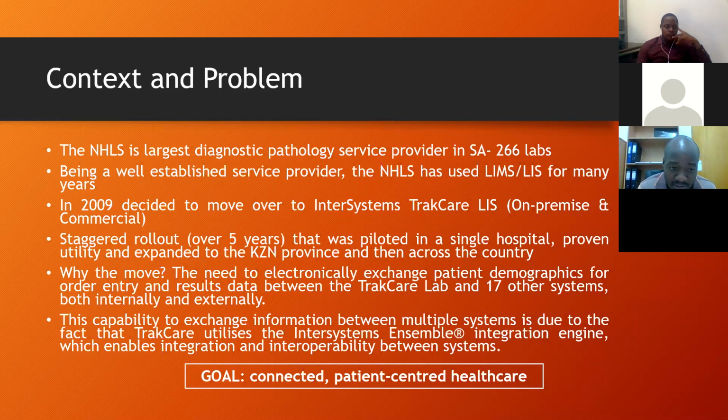This capability of exchange of information between multiple systems is due to the fact that TrakCare utilizes a powerful InterSystems Ensemble engine, which enables integration and interoperability between systems. So all analyzers within the country are integrated via this Ensemble engine. All integrations with other hospital information systems are also via this powerful Ensemble engine. Next slide, please.